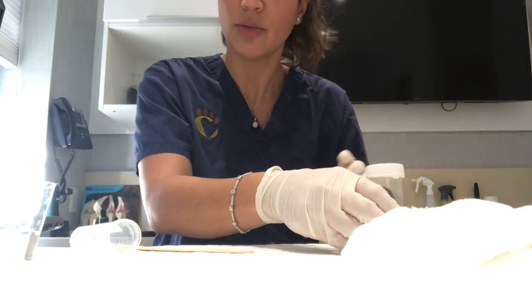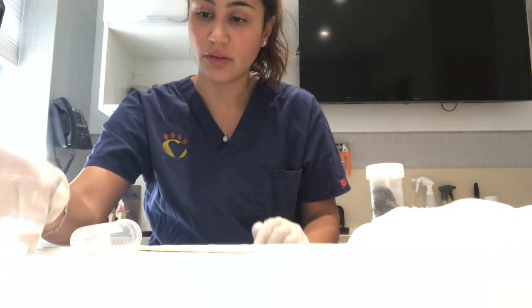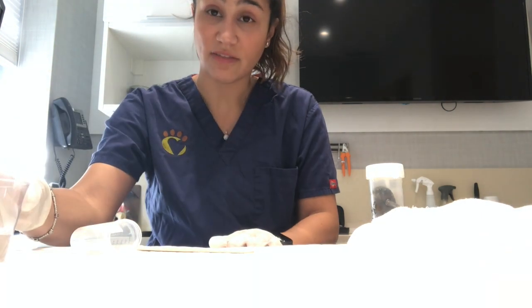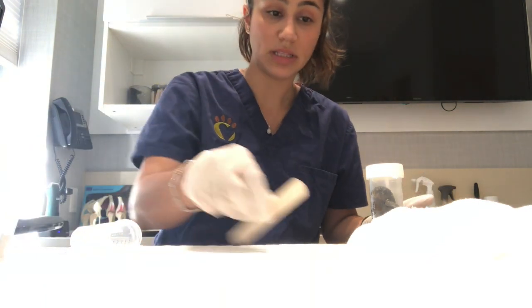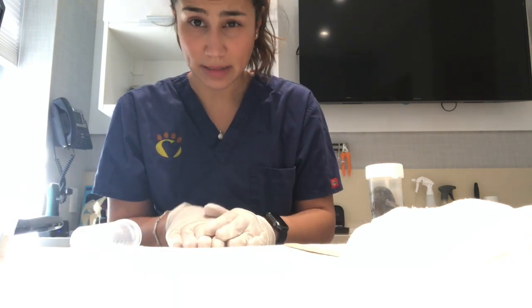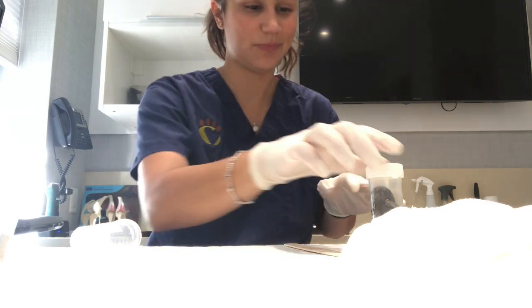Okay, so the point of a fecal flotation test is that this fecal liquid has a very high specific gravity, which is higher than any parasites. It depends on the life cycle of the parasites, but typically we do find some in the fecal float. Once the test is complete, if there are any parasites, the ova will float to the top.